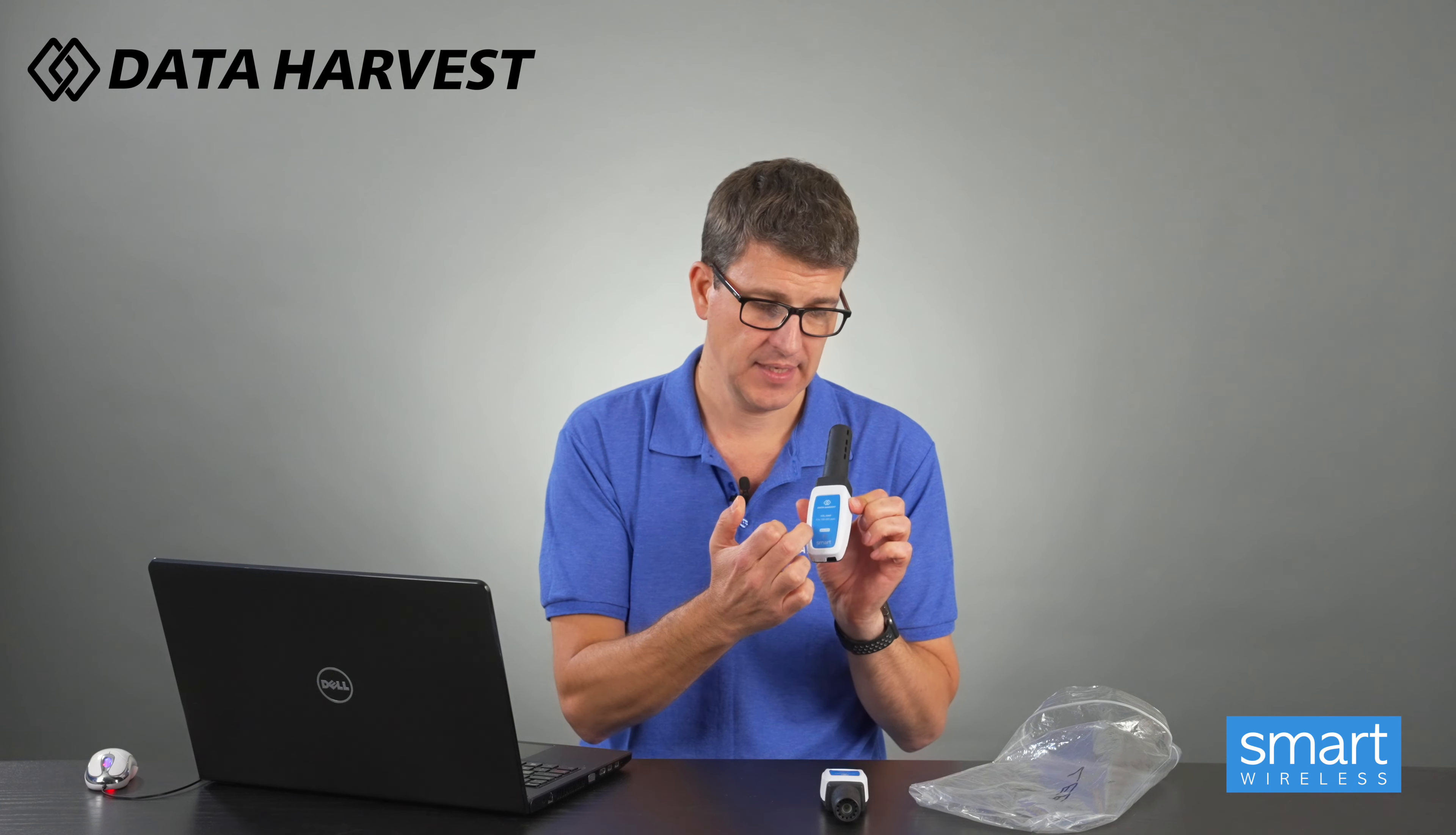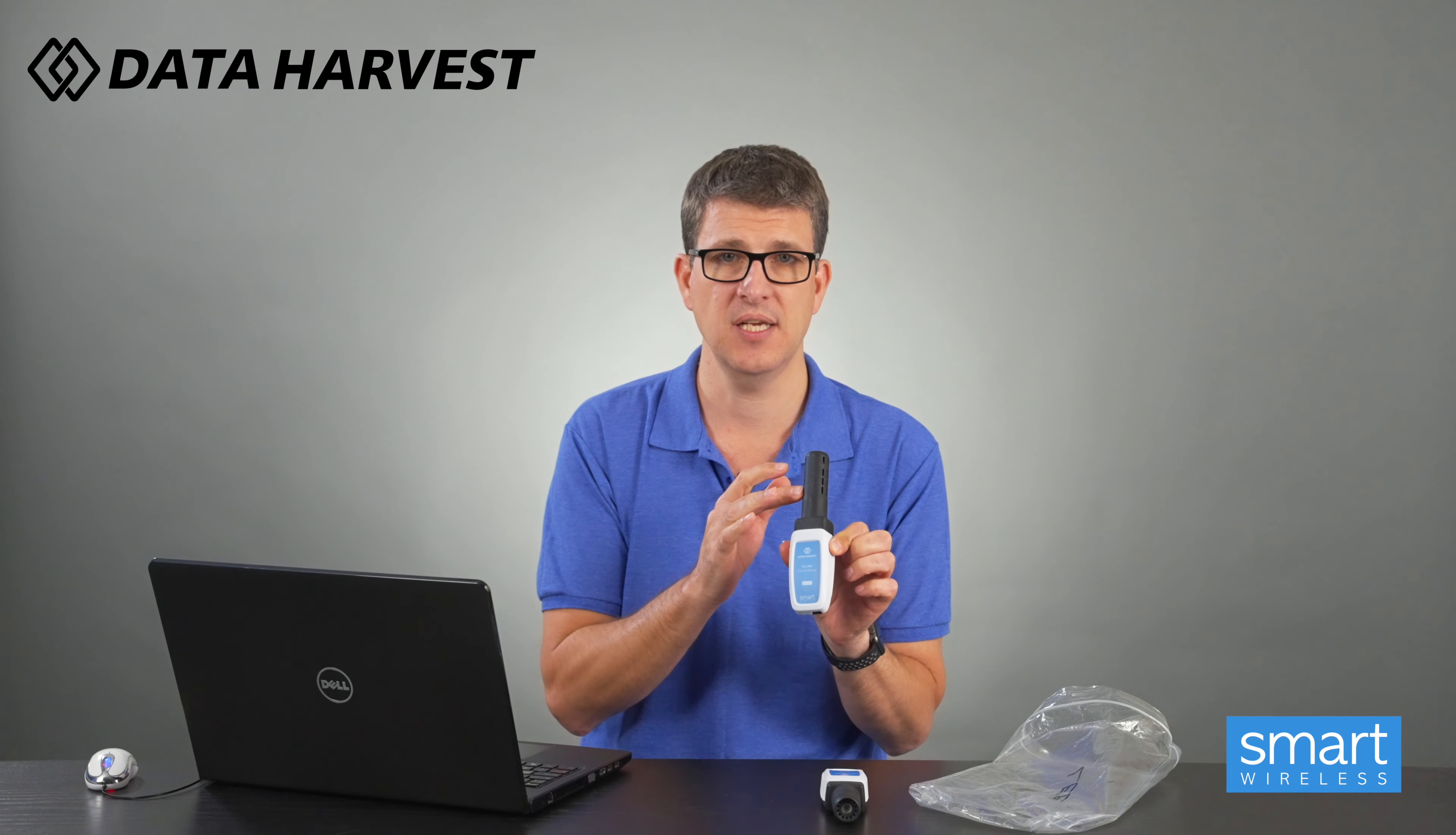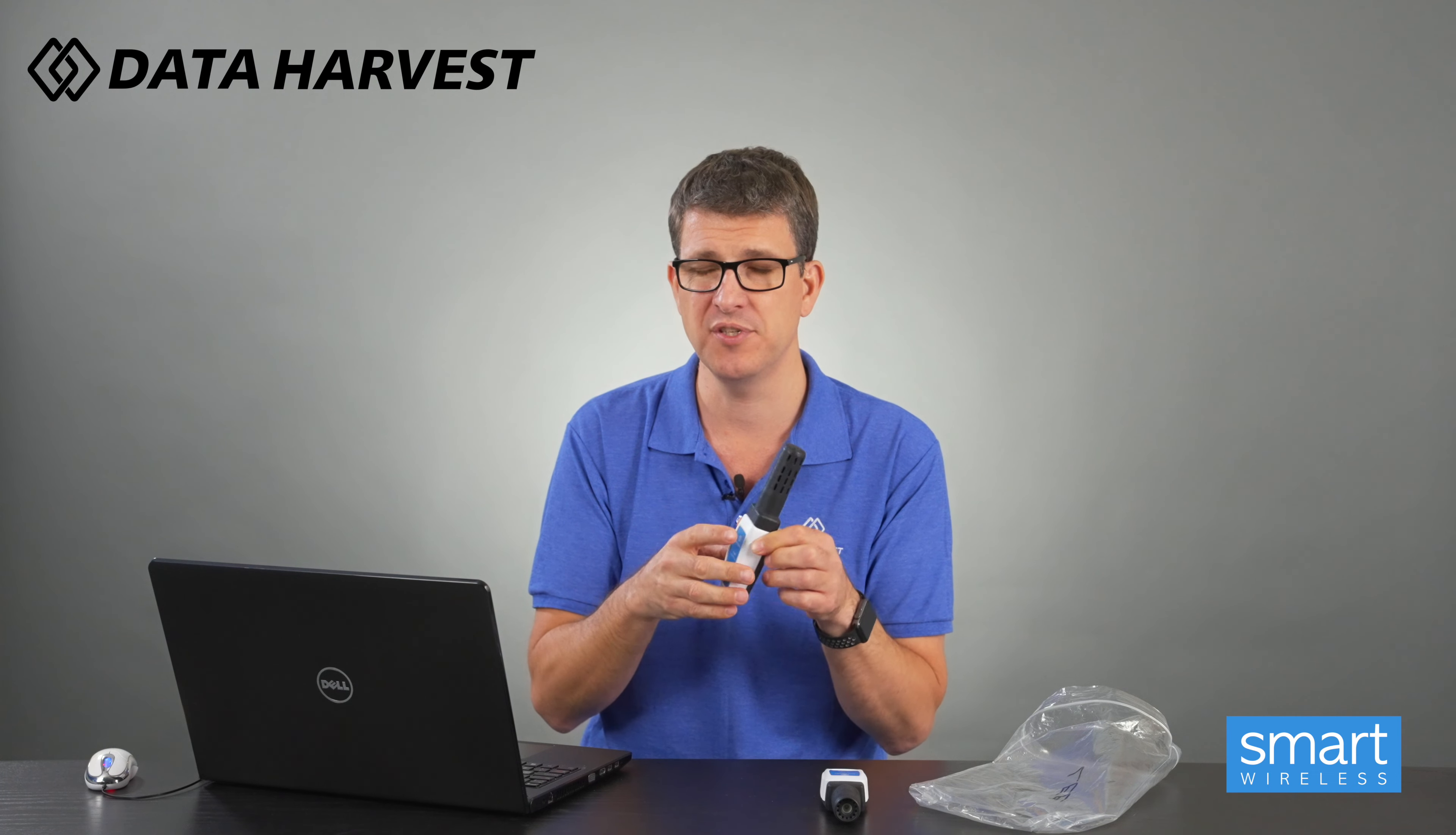We now go and open our EasySense 2 software up. On the front of both of these is a little white box there with a six digit number inside. When it comes up with data harvest, this is the CO2 sensor, it will say CO2 then that unique six digit number for every single sensor, so you always know which one you're using.